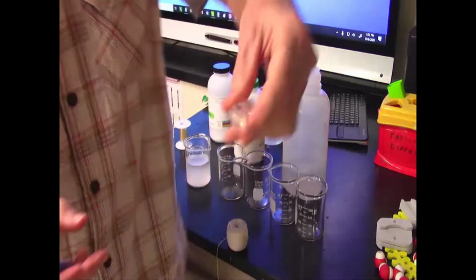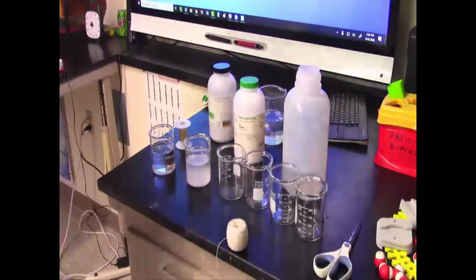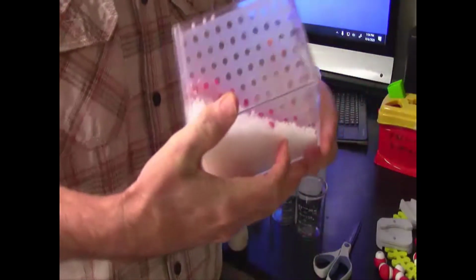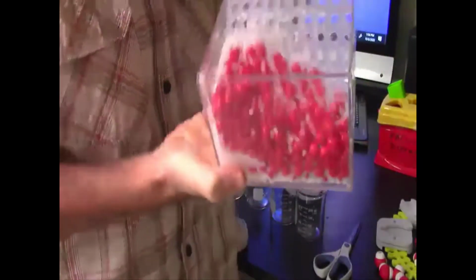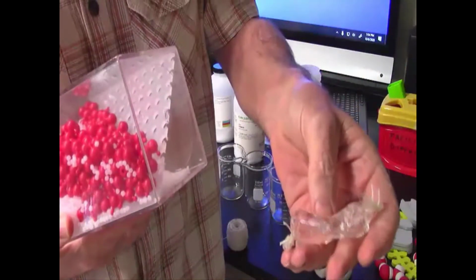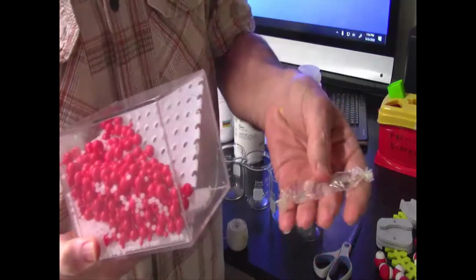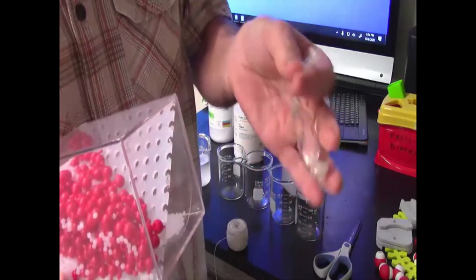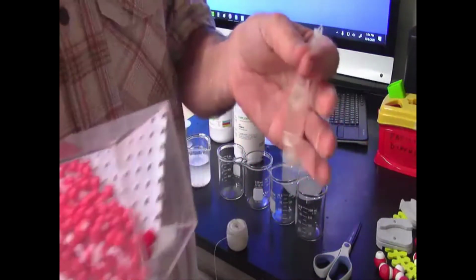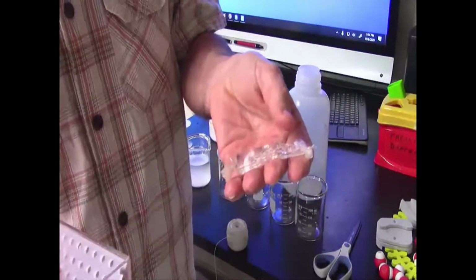So what we have here is a fake cell. It has a membrane, and that membrane has holes in it, just like this. So you can see the holes there. Well, the holes are much smaller here, but what we want to do is figure out how big are those holes. Are they bigger or smaller than a sugar molecule? And how can we tell if we can't see the molecules moving in and out? We're going to weigh this thing before and after the experiment.